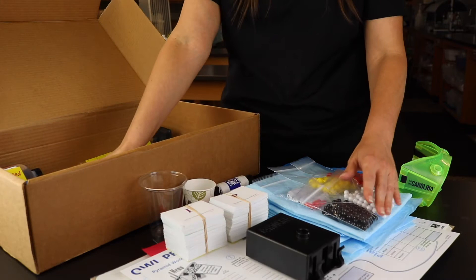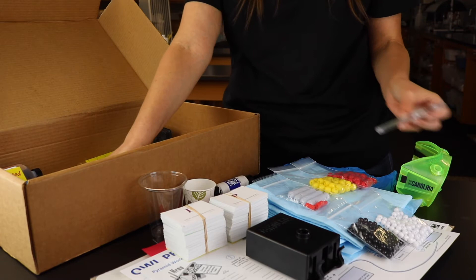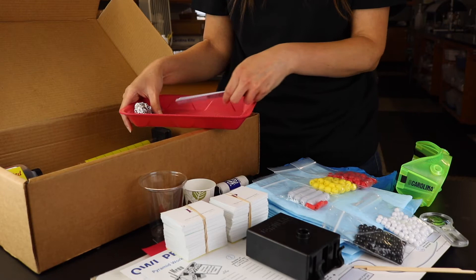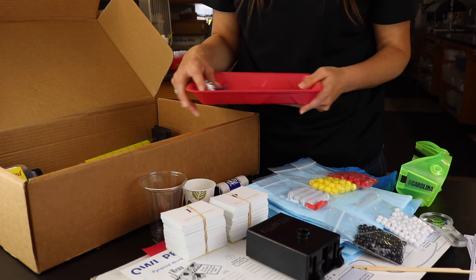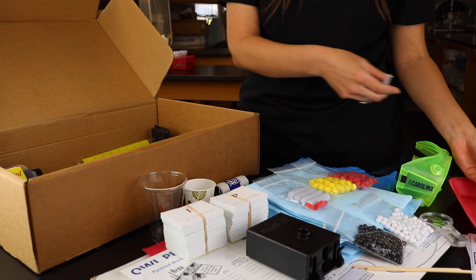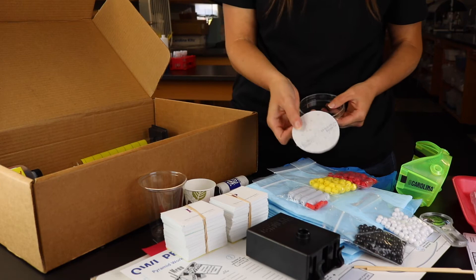Teachers can use Carolina Kits 3D Flex to provide standards-based laboratory activities wherever and whenever they need to teach. The program provides each student and teacher their own materials for laboratory investigations — no additional lab equipment or materials are needed for the entire year. All materials have been carefully selected for exemplary standards-based instruction while ensuring safe at-home use or socially distanced in-class instruction. The materials are individually packed for student distribution to maintain safety protocols and quick distribution.